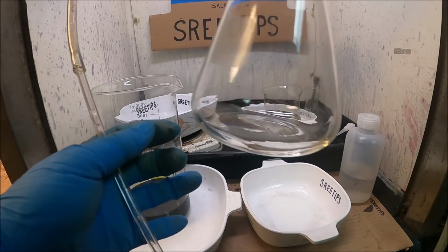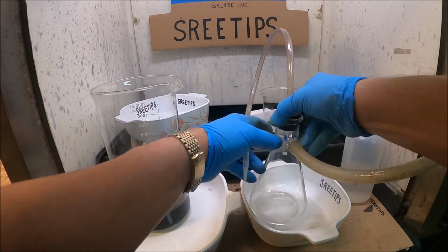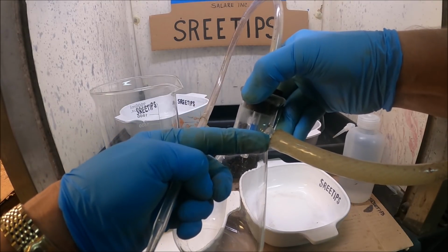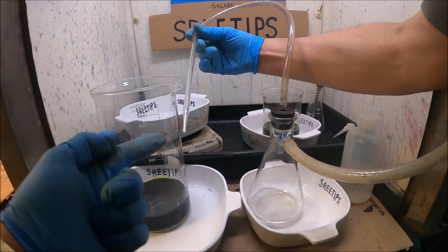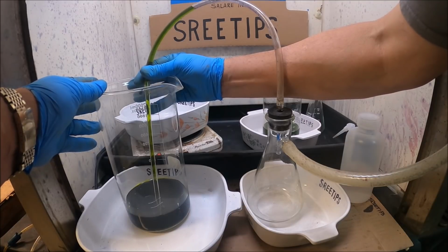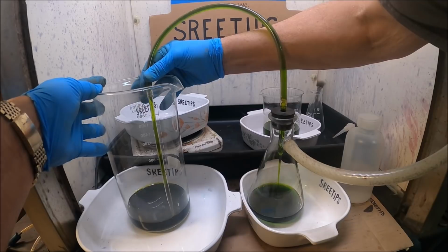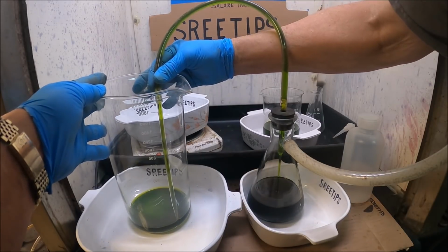Tried to get fancy on you there, and I should have just went with a routine setup here. Make sure that the pipe in here goes below the arm for the vacuum connection so we don't splash none of our liquid into this vacuum pipe here. Okay, here we go. We're gonna finish this up. I got a fine tip on this one so it doesn't draw the solution up as quickly. And this should go much better. Should have had this set up in the first place. I needed a 1 liter flask and I did not have the proper stopper size for a 1 liter flask. That's why I tried to use the flask with the ground glass stopper.